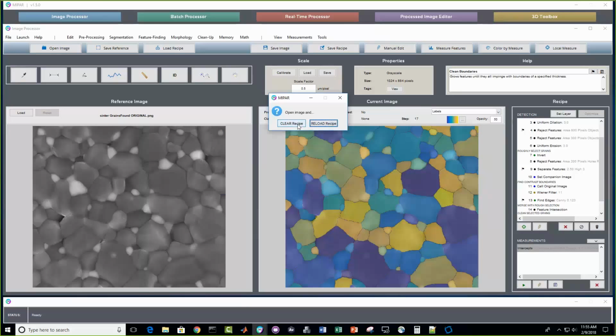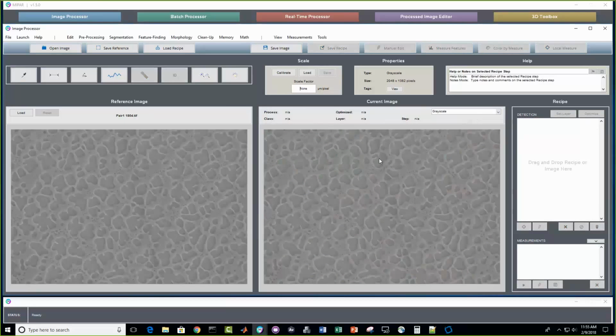Let's drag in here a nickel-based superalloy example. This is actually a very interesting project. Tim was unable to join this webinar today, and he works at NASA at the moment, and they've done some fantastic work with a new imaging technique for measuring gamma prime in gamma matrix in nickel-based superalloys, measuring size and volume fraction.